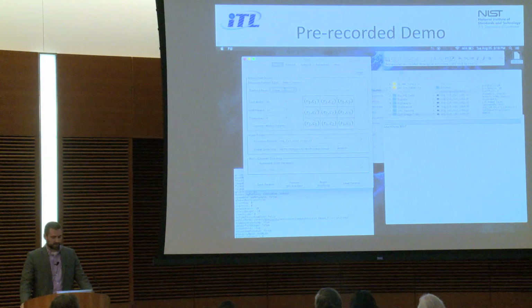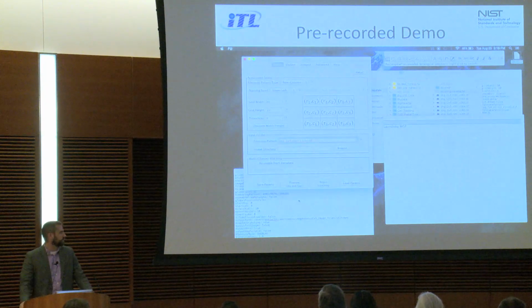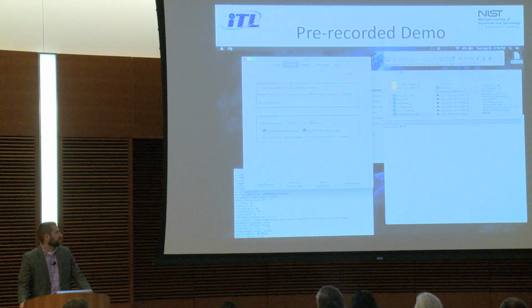For this test data set, the grid width is 10 and 10, and if you're doing a row column, you can press discover and it will automatically look at the disk and figure out what's there. Next, you want to set up the image file name, and we've kind of matched the Fiji stitching plugin for file formats using the curly brackets to denote iterators. And I've got the file paths selected here and saved off in a text file so I don't have to mistype them.